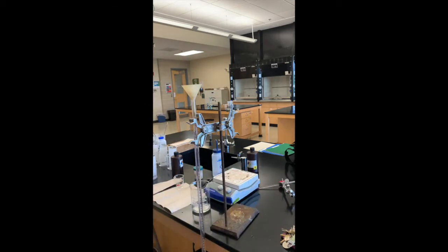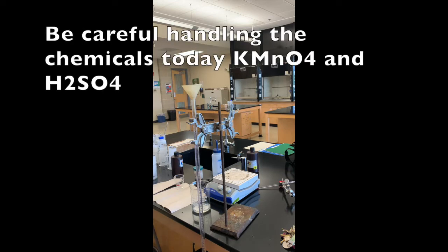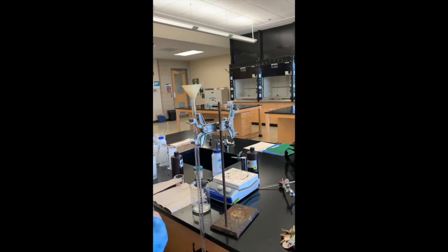In today's lab, when you are handling the potassium permanganate and the sulfuric acid, you want to be really careful — gloves would be a good idea. I'm putting on gloves before I handle the potassium permanganate. For extra safety you could also wear a lab coat or long sleeves.